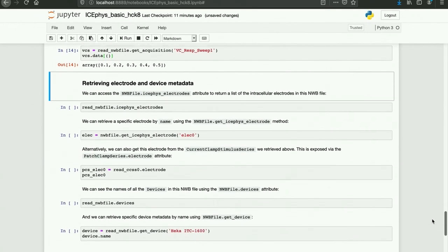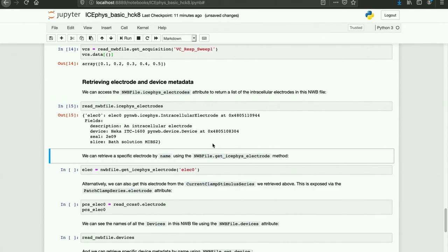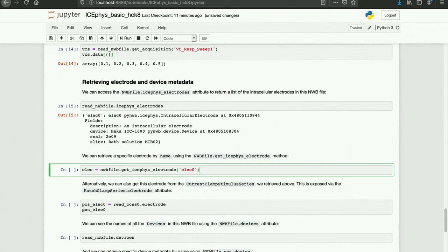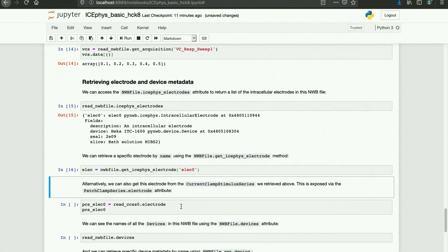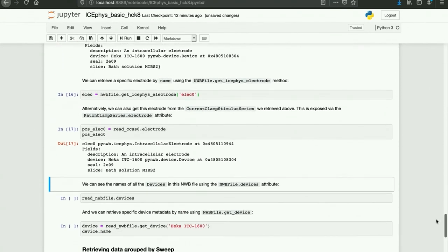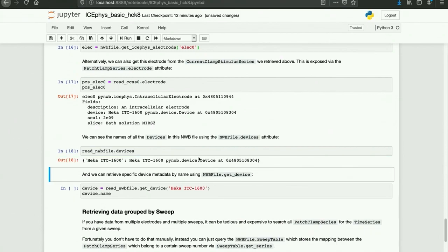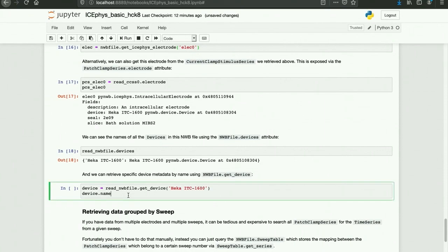Now we can get a list of electrode data by reading NWBFile.icephyselectrodes. We can then use the name of the electrode to retrieve that specific electrode using NWBFile.geticephyselectrode. Alternatively, we can also access that electrode metadata using the current clamp series that we retrieved above, exposed using patch clamp series dot electrode. Finally, we can also see the names of all the devices in the NWBFile using the NWBFile.devices attribute and retrieve the device we want using getDevice on that device name.